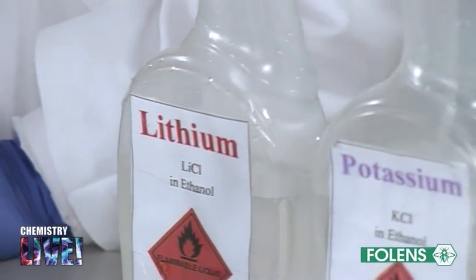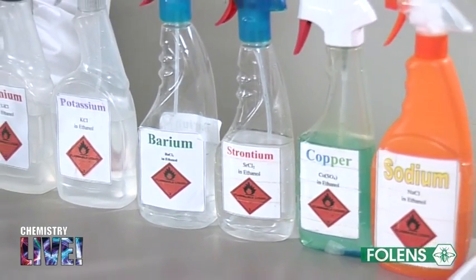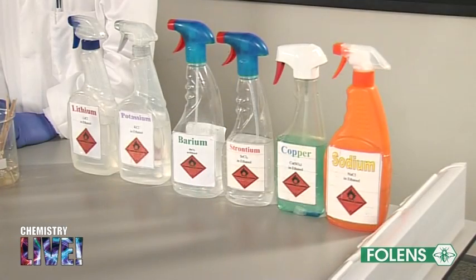We conclude from this experiment that each metal gives a characteristic color to the Bunsen flame. This characteristic color can be used to identify the presence of a particular metal in an unknown sample. And this concludes the experiment.